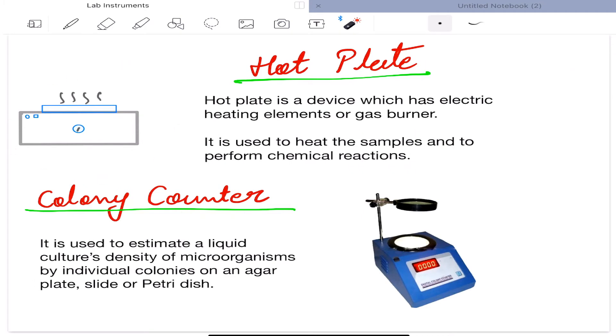Next is hot plate. Hot plate is a device which has electric heating elements or a gas burner. It is used to heat the samples and to perform chemical reactions. Next is colony counter. It is used to estimate the liquid culture's density of microorganisms by individual colonies on an agar plate, slide, or petri dish.